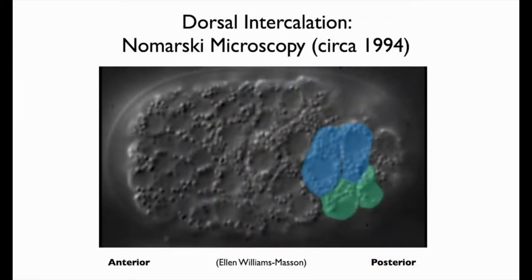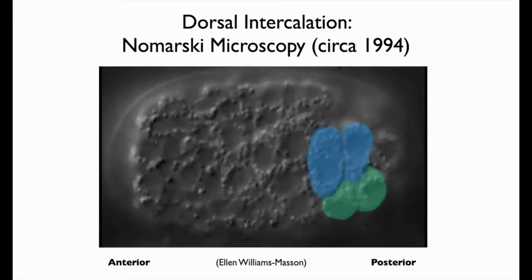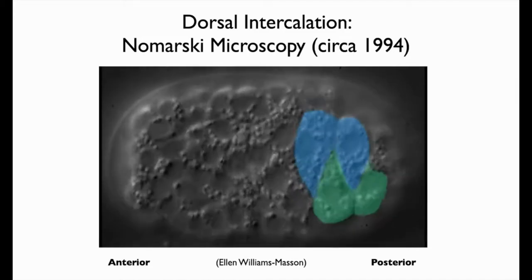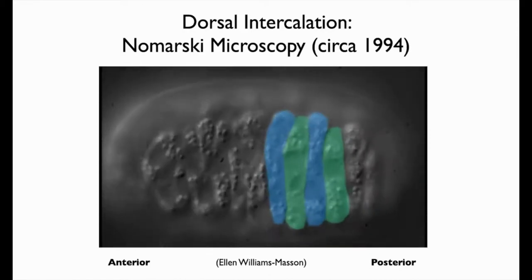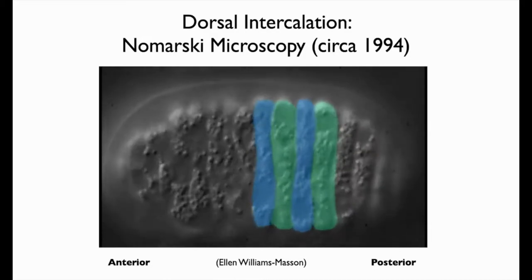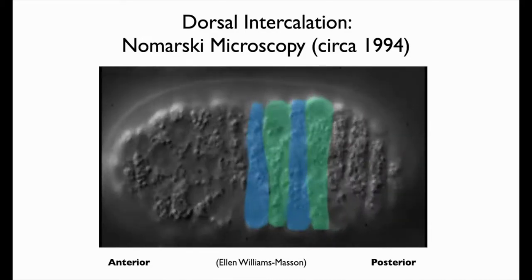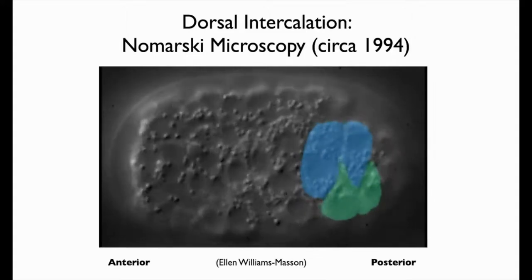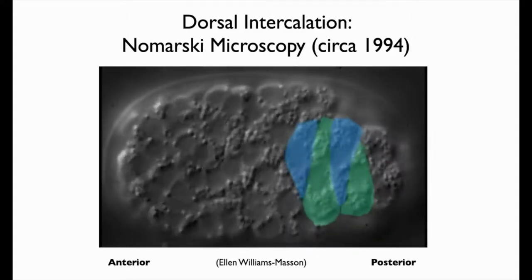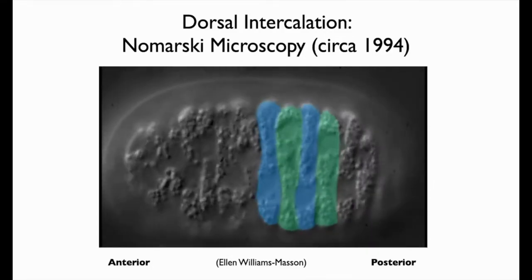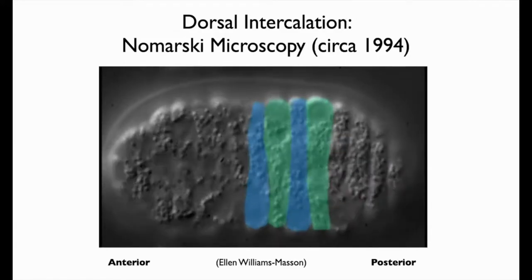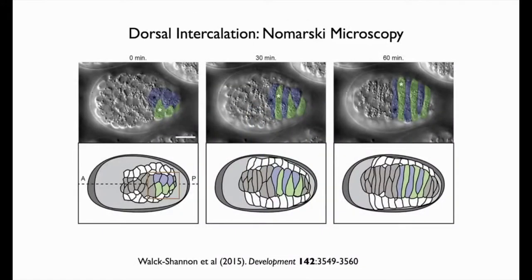Here's an embryo image using Nomarski microscopy, with four cells colorized to show how they change position during dorsal intercalation. Anterior is on the left, posterior on the right. These four cells become wedge-shaped and move between one another in an alternating fashion. By the end, this group of 20 cells in total engage in one round of rearrangement to make a single row of cells across the dorsal midline. As far as I know, this is the simplest case of a convergent extension-type movement.